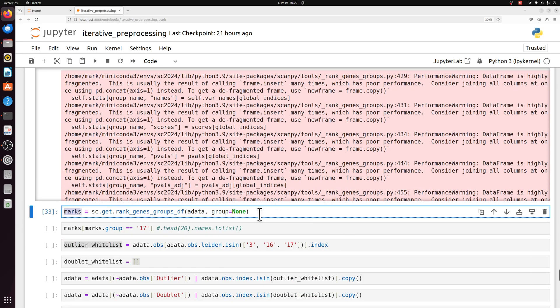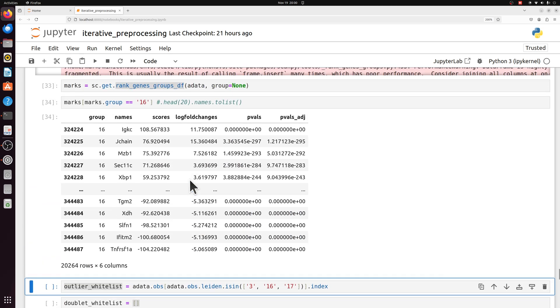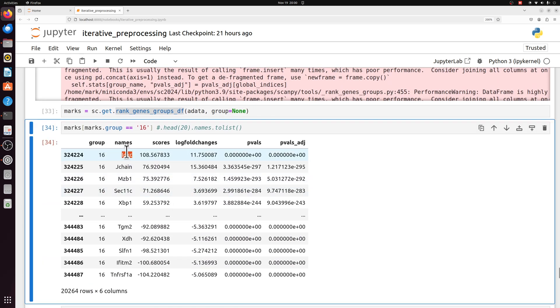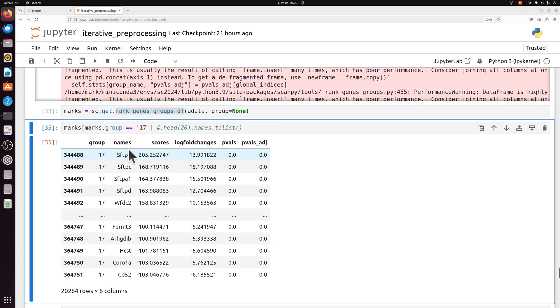So we're getting the marker data frame. We already saw that three most likely neutrophils. If we do 16, 16 actually expresses some well-known markers of plasma cells. So 16 looks like a plasma cell population. Cluster 17, the top markers are surfactant proteins, and this is lung data. So these are probably type 2 epithelial cells. All three of these populations would have been thrown away if we didn't do this iterative preprocessing.